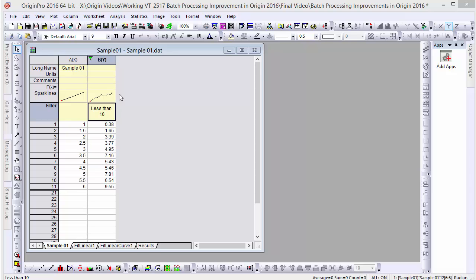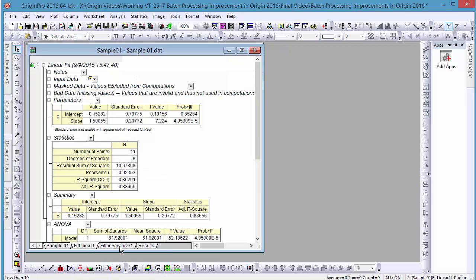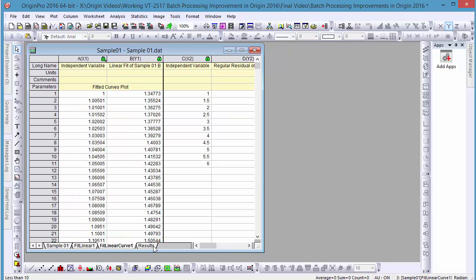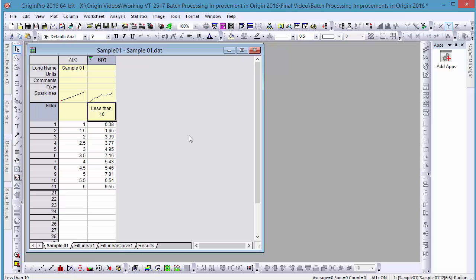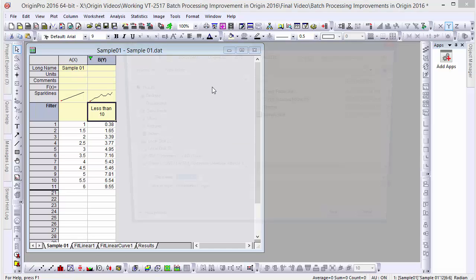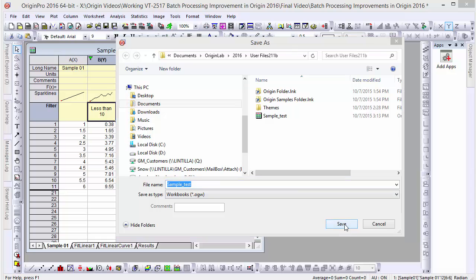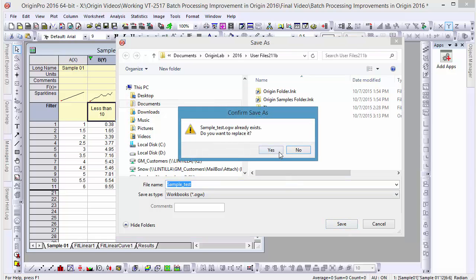Here we have a sample set of data which has been imported into a workbook and fitted for a linear curve. Let's right-click on our window and save this as an analysis template in our user file folder. Then let's close our data and create a new workbook.